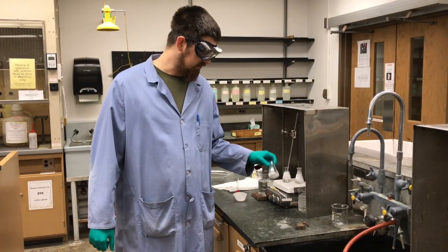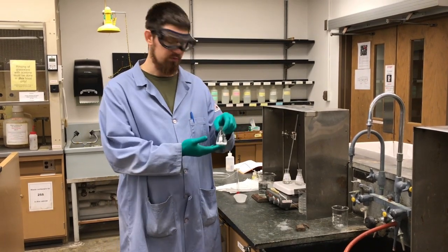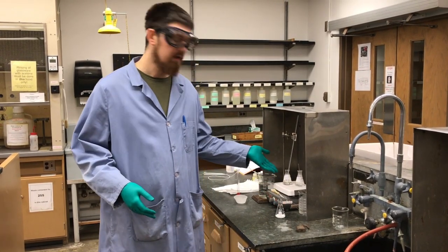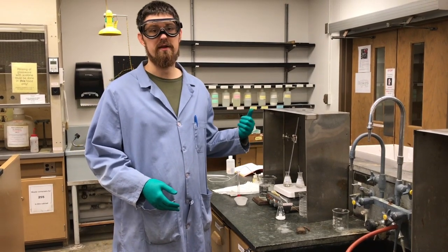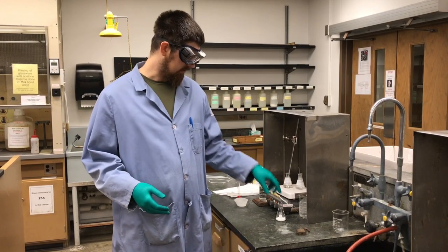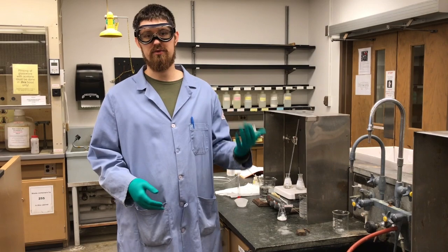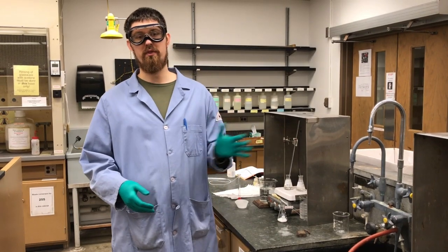So for recrystallization, we're going to do something a little different than normal. What we're going to do is dissolve our crude product in a minimum amount of warm ethanol. Then we're going to add a minimum amount of warm water to the still heated, just solubilized mixture until it starts to precipitate out and get cloudy. And then we're going to cool that down.